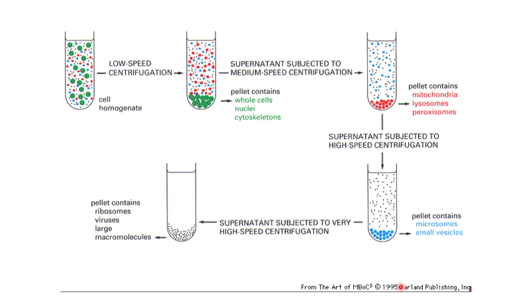Like I was mentioning about the crude fractionation and the selective fractionation. First, when you open up the cell having your particular protein of interest, because the bacteria is also growing that particular protein, you need to take the protein out into the solution. For that you have different chemicals like sodium dodecyl sulfate. You have harsh chemicals that you can use that will break open the peptidoglycan layer, and your protein and all the organelles come out. Then you get the cell homogenate.